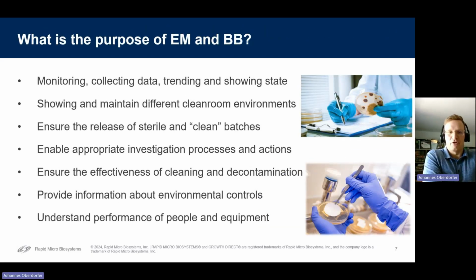So what is the purpose of all of these EM and bioburden monitoring programs at all? Not only to collect data and to have them. Some data analysts or statisticians might think, hey, it is good to have a lot of data. Yeah, correct. But not only the data collection, but also to trend, to monitor, and to give feedback, to evaluate it. It's important. With great data comes great responsibility, and you have to evaluate it, because what do you do otherwise with the data?